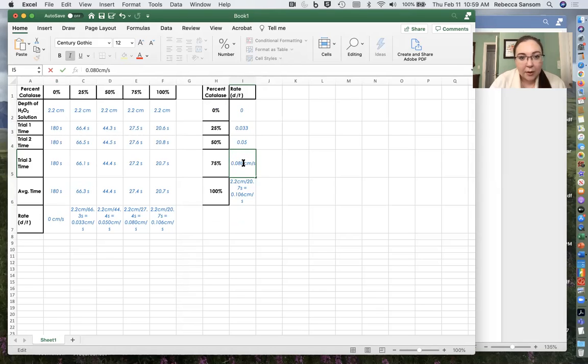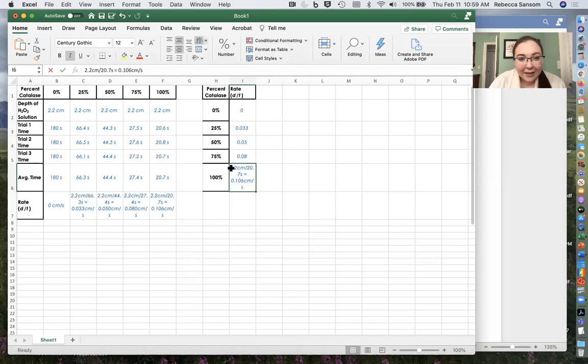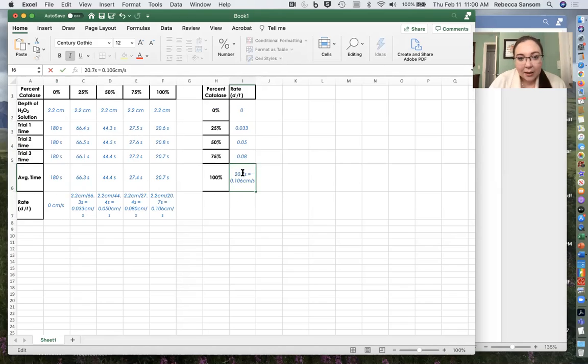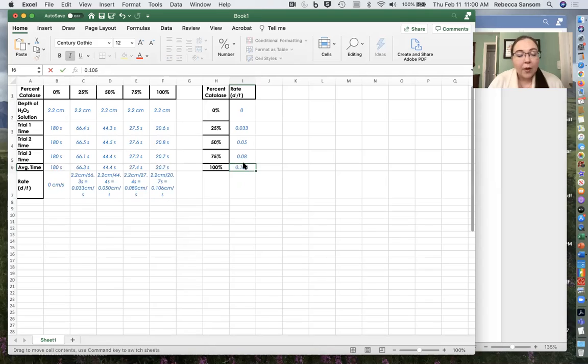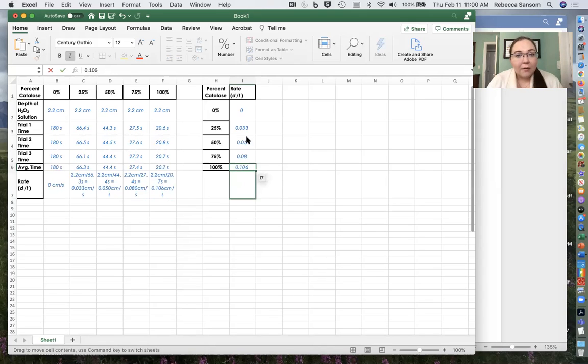I can do it. Okay, there we go. And the last one here. Getting rid of our extraneous stuff and getting rid of the units. So we've got all of these numbers here.